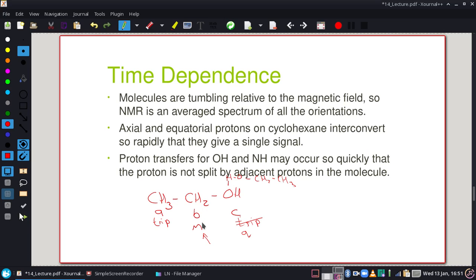But it's more of a might. It needs to be nearby, it needs to be adjacent, but it may or may not be there. And on anything with an OH bond, there's a possibility there's one above it, maybe one below it. So we might have more than one H that comes in there and splits it. So in a typical NMR, any OH peak and any NH peak can look odd simply because of hydrogen bonds.